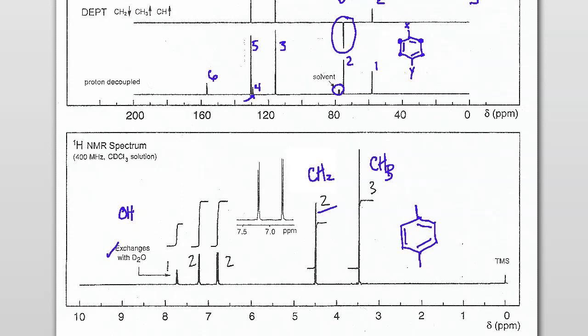So when we do this, this is C6H4. So what we can do is start taking away from our molecular formula to see what's left, just to confirm. So it's C8H10O2. Now what I'll do is subtract the alcohol, because we've confirmed that through IR and most certainly through the other specs that we have here.